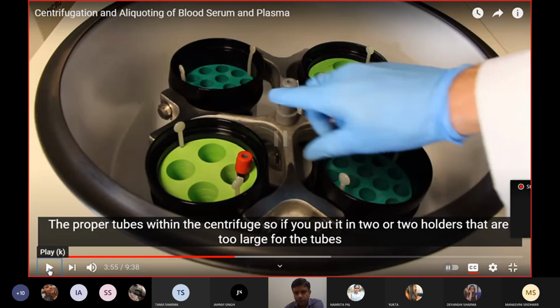Okay, students. So here you can see there are different types of centrifuge holders, tube holders, right? So you can see, first thing, it has to be balanced. So students, whenever you are working with a centrifuge, all the four ends have to be balanced.